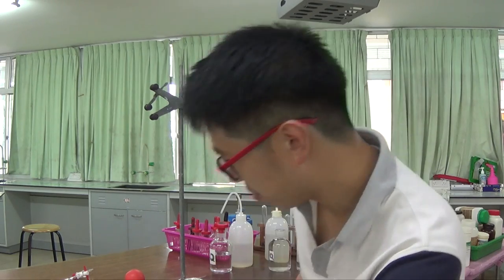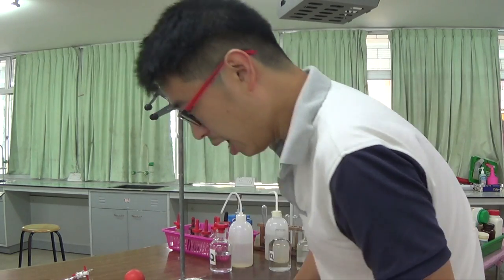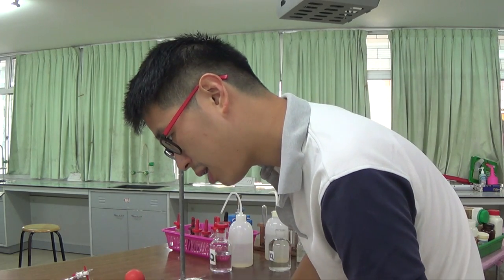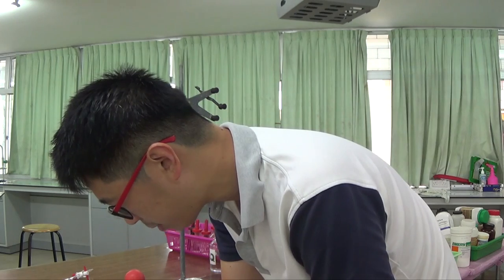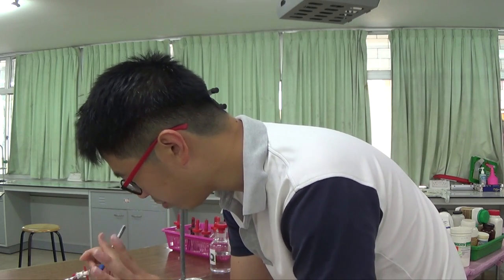Alright, so let's get started. I've talked a lot. So, first step, the experiment. I'm going to pipette 25.0 cm³ of P. So, you don't really see me doing it on paper. You always see me doing it on the screen.